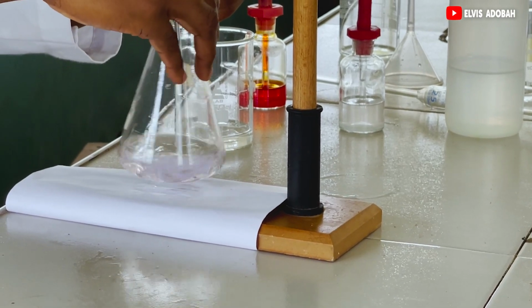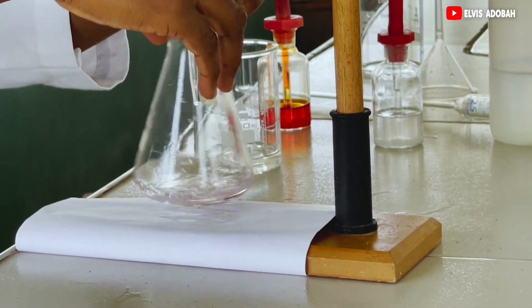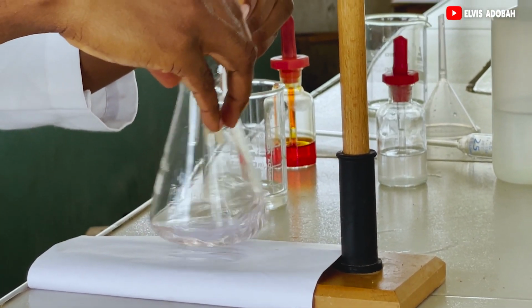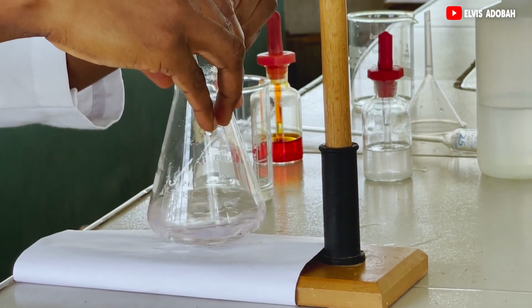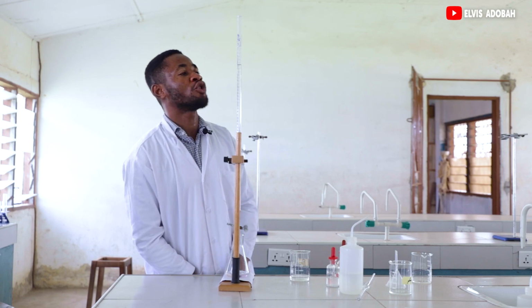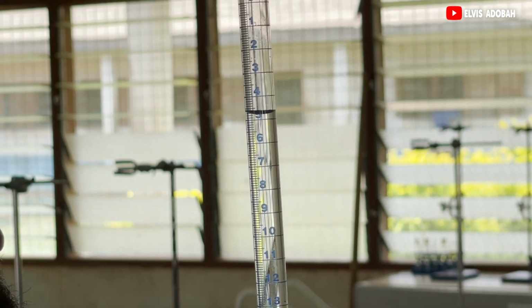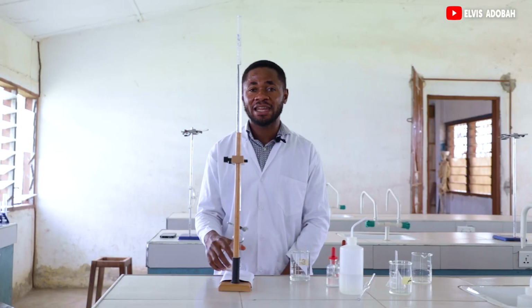The color looks colorless, but there are still some traces of purple inside, so you want to get rid of those traces. Colorless. And the volume is at 4.80 centimeters cube. We record that volume, then we will discard our solution.